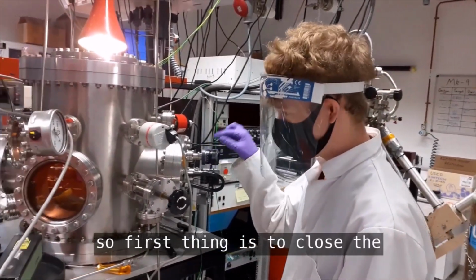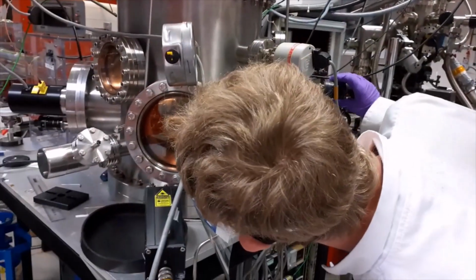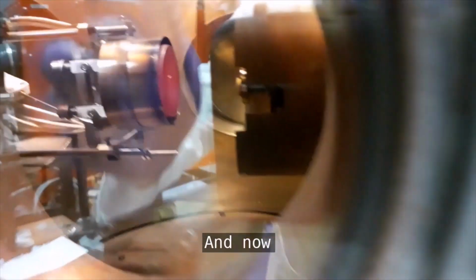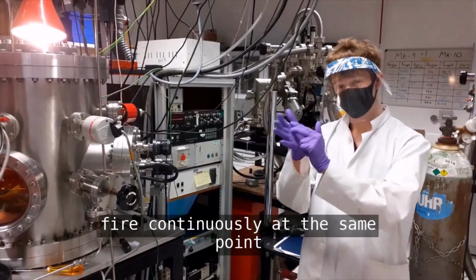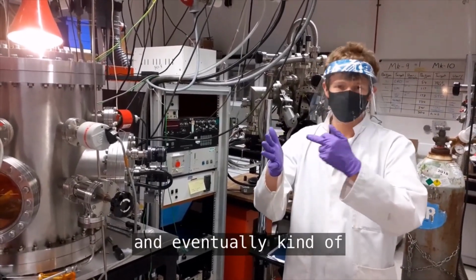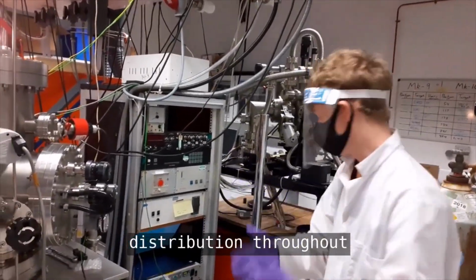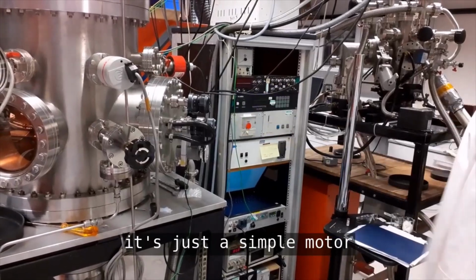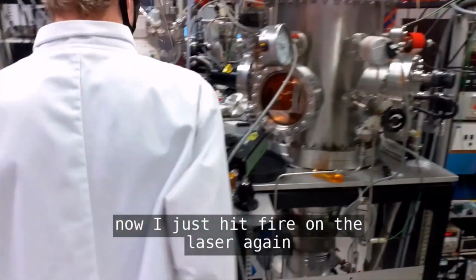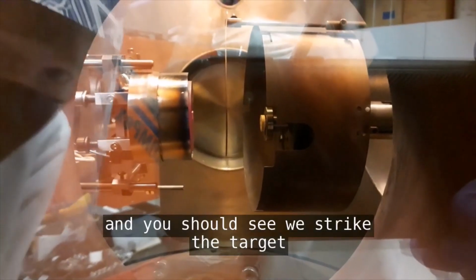So first thing is to close the shutter. This just blocks any material from actually growing on the substrate at this point. So that just closes like that. And now I'm going to set the target itself rotating. Rather than having the laser fire continuously at the same point, and eventually overheating and damaging that point, we keep it rotating so we get a nice even distribution throughout. So that's just down there like so, and you can see it's spinning. It's just a simple motor. So now I just hit fire on the laser again. And you should see we strike the target.